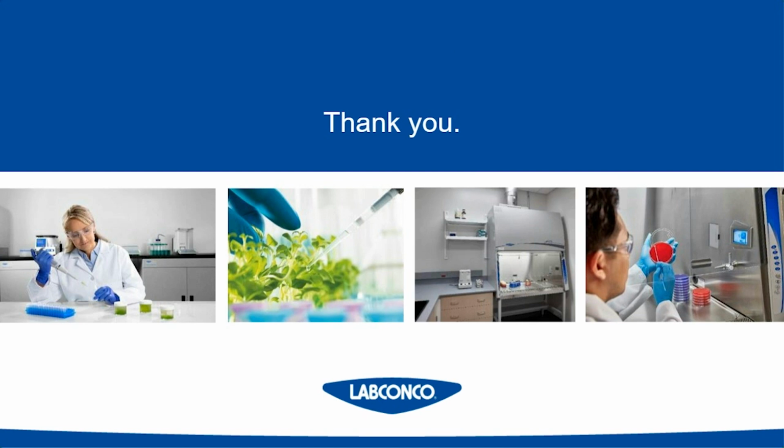Our first question here is, how do I know if the amount of fuming chemical I am using requires an A2 with canopy or if a B2 or C1 would work? That's a really great question, and this is another area where your institutional EH&S committee can help out. A couple of the things you need to consider: one is that if your volatile chemical is flammable, you want to make sure you're working well below the lower explosive limit of that chemical.